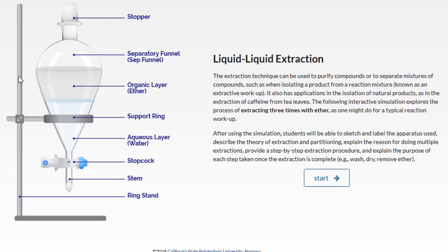Let's take a quick look at the equipment we'll need to do an extraction. What we're using here is called a separatory funnel, or just a sep funnel for short. It has a stopper that fits on top — this might be a ground glass stopper or maybe a plastic one. Down at the bottom we have a stopcock.